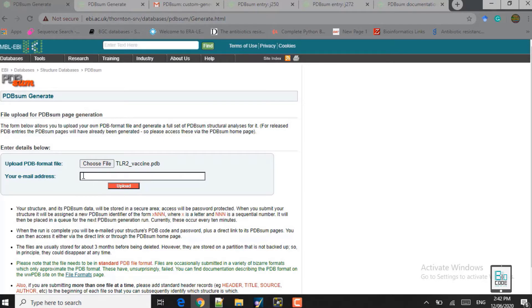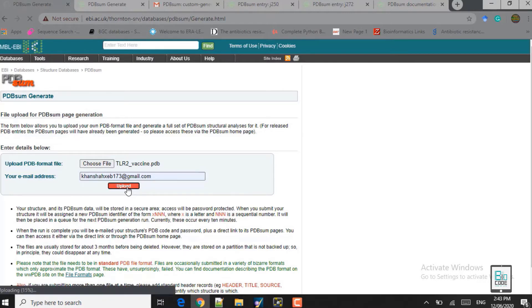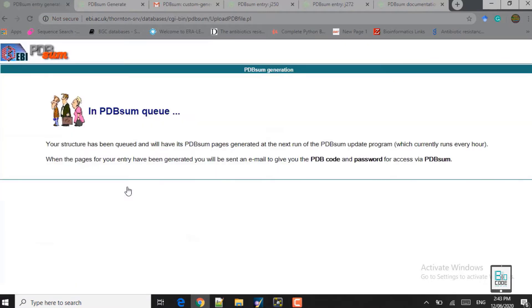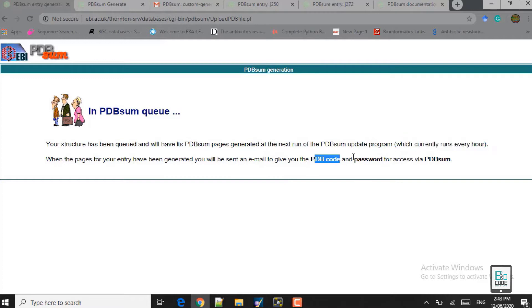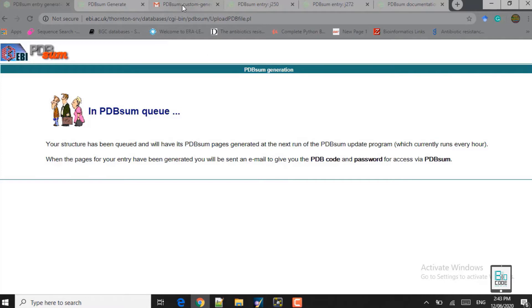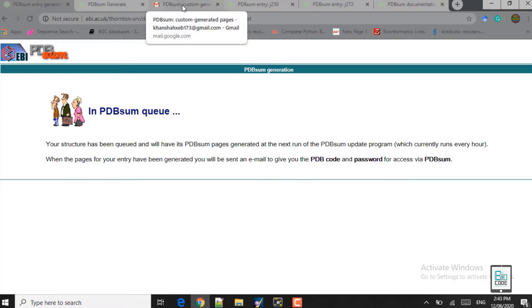Now in this box you will provide your email ID. I will provide my email ID and click on upload. Once you click on upload you will get a message that this will take about 10 to 15 minutes to provide the results in your email inbox. Here you can see: 'Your structure has been received and will have its PDBsum pages generated at the next run of the PDBsum update program, which currently runs every hour. When the pages for your entry have been generated, you will be sent an email with the PDB code and password to access via PDBsum.'